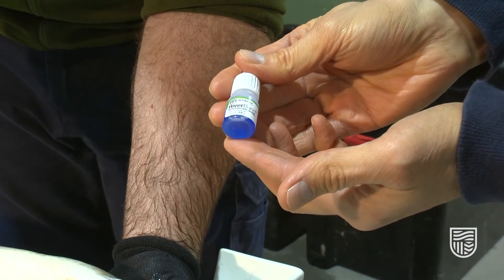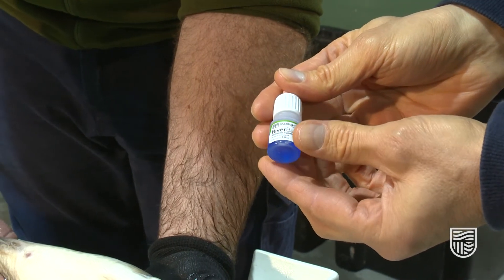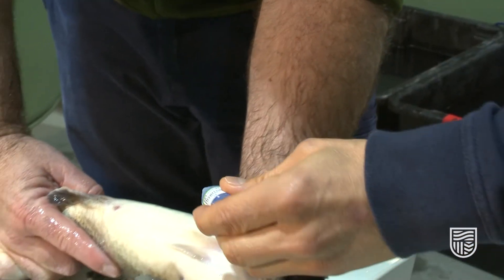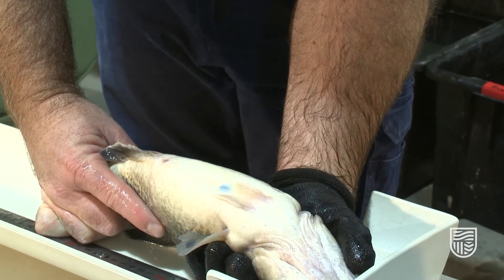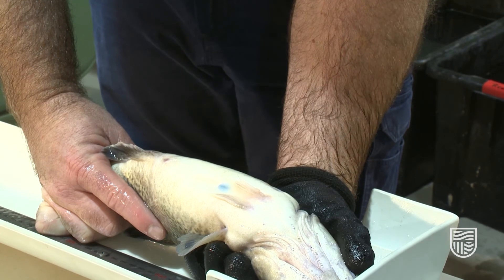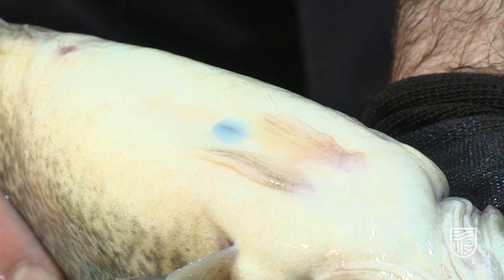This product, which can be used particularly when you use surgery, is called Vet Bond or River Bond — it's like super glue that you can use for surgical wounds. You just remove it and place it over the wound like that, and it acts as another layer of protection preventing infection. It will set as a hard resin, and as the wound heals it will just fall off and the fish will swim normally.